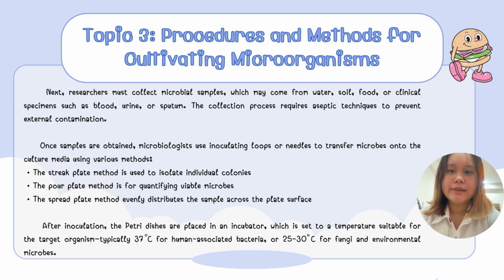The collection process requires aseptic technique to prevent external contamination. Once samples are obtained, microbiologists use inoculating loops or needles to transfer microbes onto the culture media using various methods.